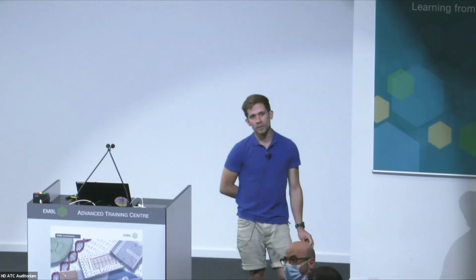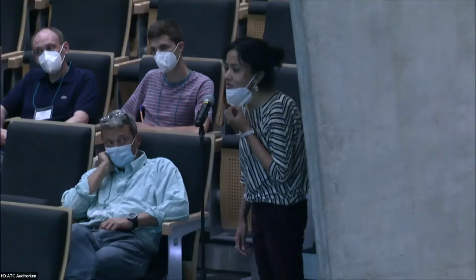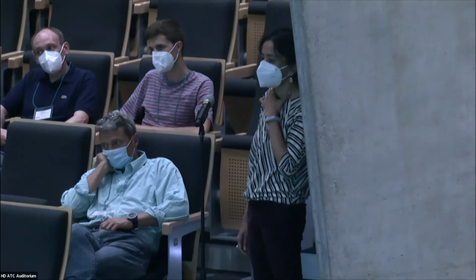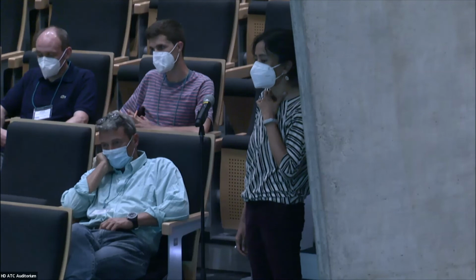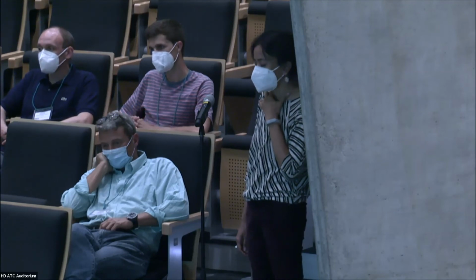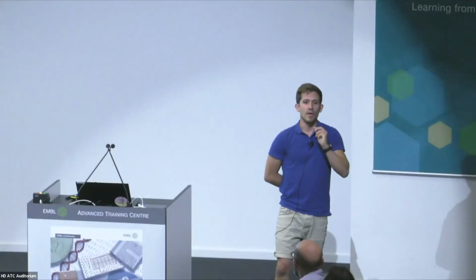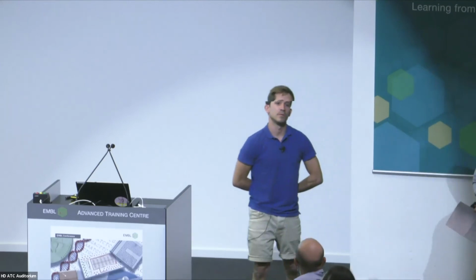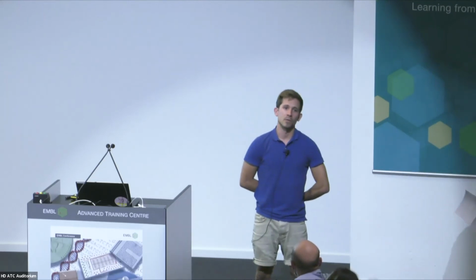Can I ask one more question? Are you planning to add microbes also into the system? Yeah, of course. They are super relevant, right? We want to include microbiotas. That includes further challenges because the majority of microbes that are resident in the gut will be anaerobic. So there needs to be some way of getting hypoxia in the devices. Our device for now is PDMS based, which is super gas permeable. So that's going to be another challenge, but it's something that we want to do and include as well.